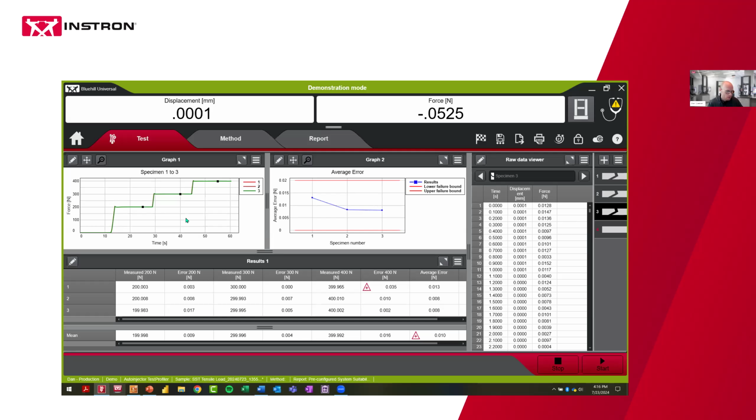And so if your LIMS system or something is really looking to just plot a curve with 1,000 points, not 25,000, then you can guarantee every specimen that is run and every CSV file that's output will have that consistent number of points.